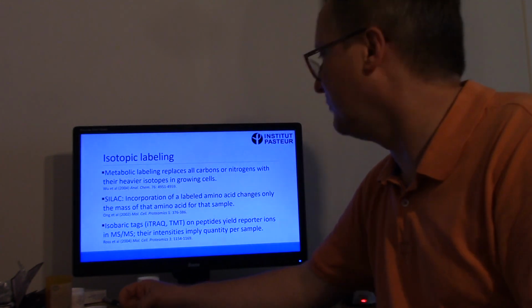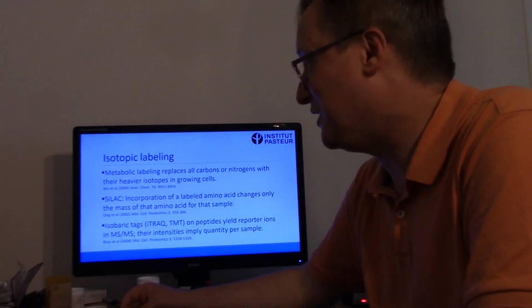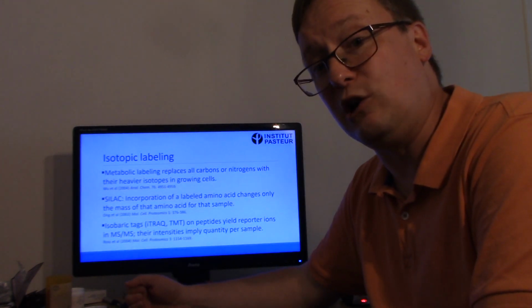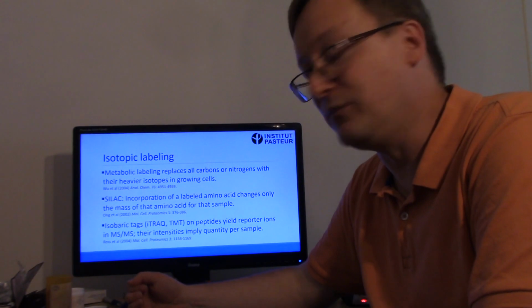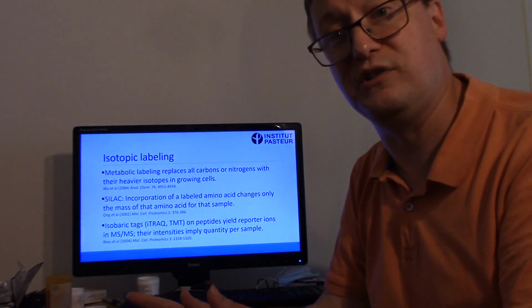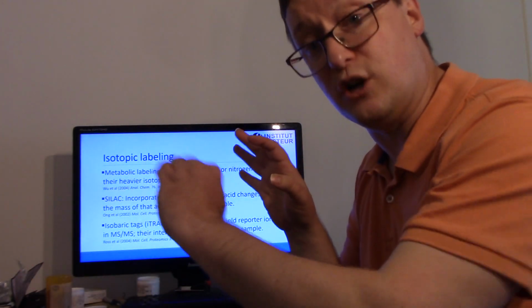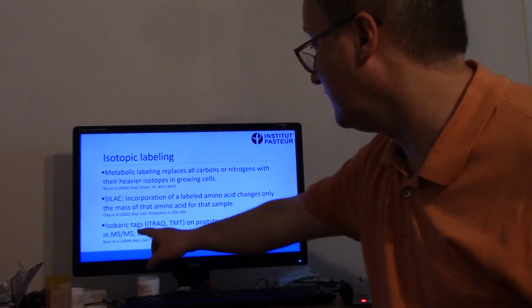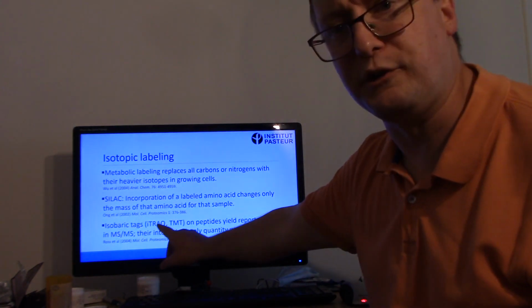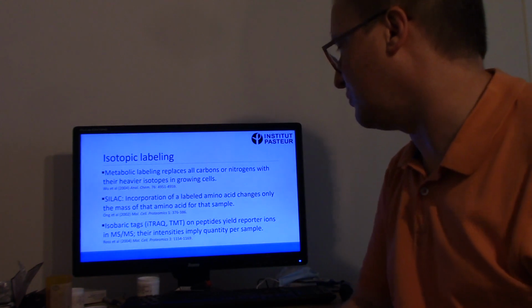their carbon, for example. So in something like that, particularly like in human experimentation, we instead make use of something called an isobaric tag. And an isobaric tag is something where you digest up your original sample to peptides, and then you stick on to the N-terminus of the peptides you've produced these isobaric tags, often sold under the trade names iTRAQ or TMT, depending on the manufacturer.